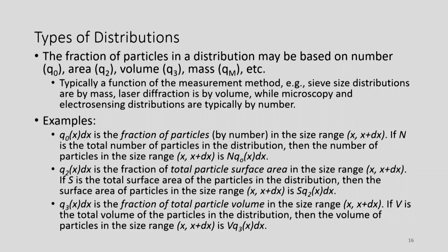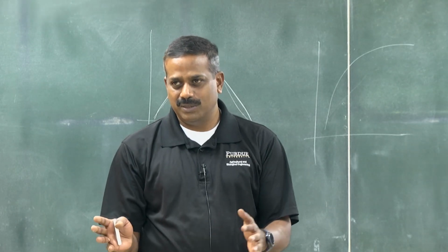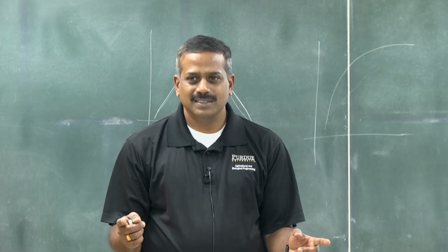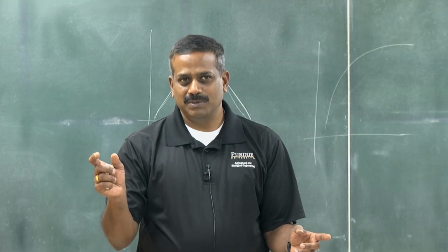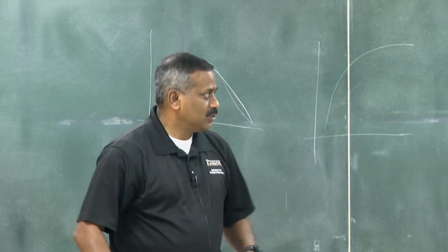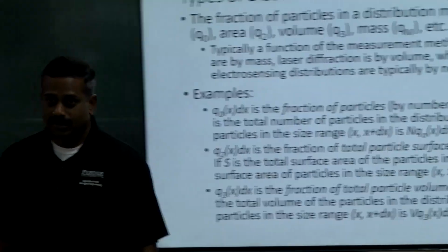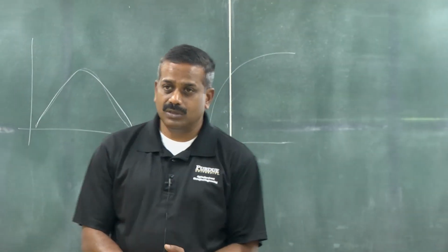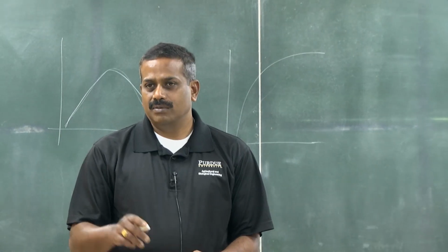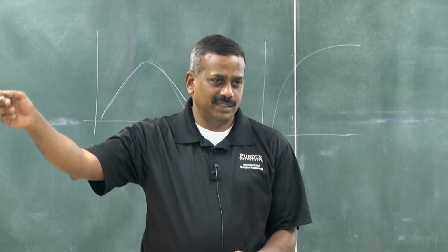I very briefly talked about that yesterday, but what is the factor that we have to use to convert from one distribution to another, anyone remember? What's that? Someone said something. There is a factor, it ends with factor. It's a shape factor, okay. So you use a shape factor to convert from one distribution to another, but it's strongly discouraged, because when you use a shape factor and convert from one distribution to another, your error will also multiply, as I briefly mentioned yesterday too. If it's from volume based, then the error multiplies by 3 times, cubed, okay.